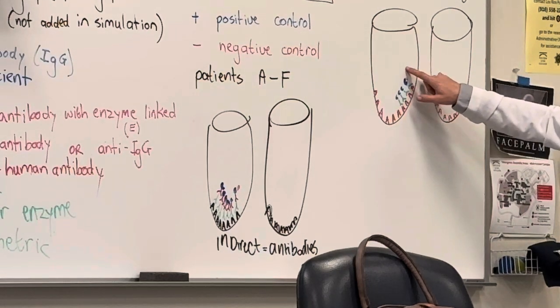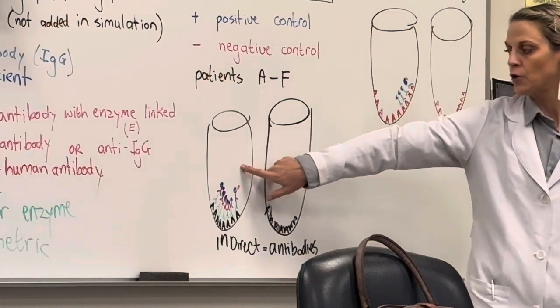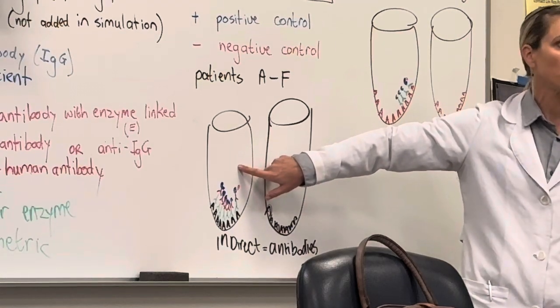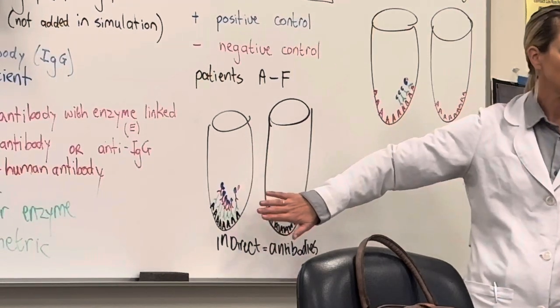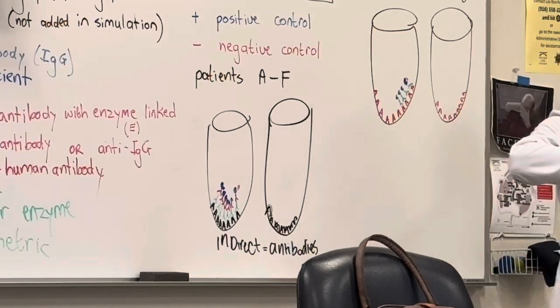So for direct, you can figure out what your patient has. This one, you have to know. This is the HIV well. I bought this HIV well from the well store, and that's all I can test for, because it's already stuck to the bottom. Does that help? Okay.